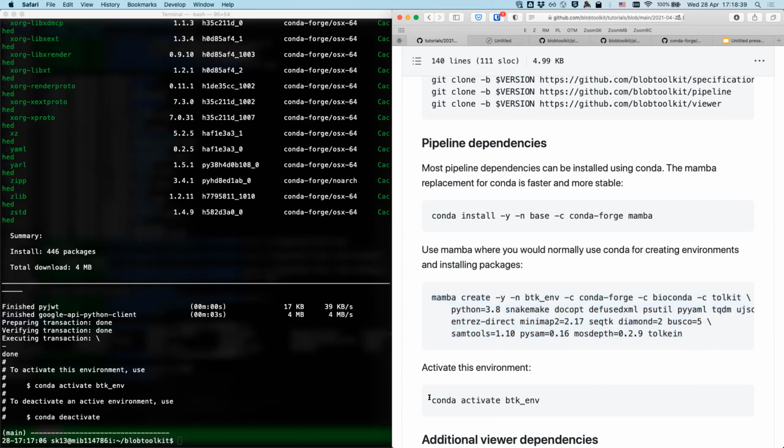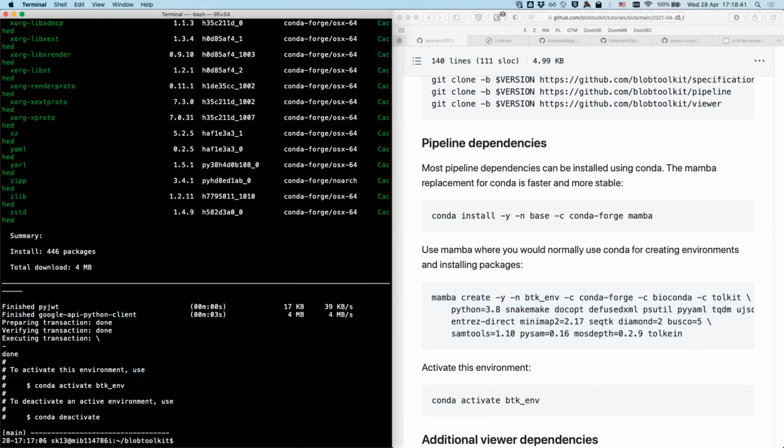Cool. Okay. Mine has finished quite early. If whoever was following along, has it finished? If it hasn't finished, just say no. Oh, yes is good. Yes is good. Nicola, I don't know if yours finished, if you were following. Oh, Luis. I'm just watching. Oh, you're watching. I'm sorry, I forgot. And Luis, is it just scrolling by screen after screen?